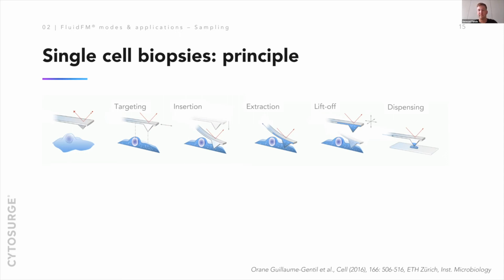So it is quite easy to extract a few picoliters, up to 2 picoliters, without compromising cell viability at all. And we can also extract more, and the cell viability still is very high. This stands for the cytoplasm. Of course, if we go into the nucleus and just suck out half of the genome, then the cell doesn't stand a lot of chance.